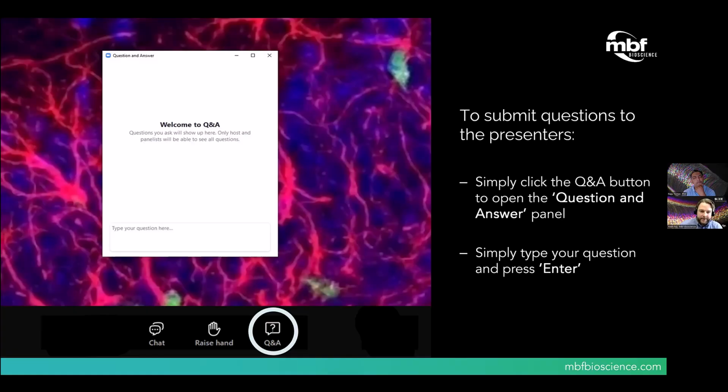See another question here about, can the light sources be replaced by an end user in the field? I would not recommend doing this. It would be a difficult procedure to achieve, and the light sources that are included in the SLICE are really optimized to make the SLICE this high performance imaging engine that it is. So I would not recommend doing this in the field.